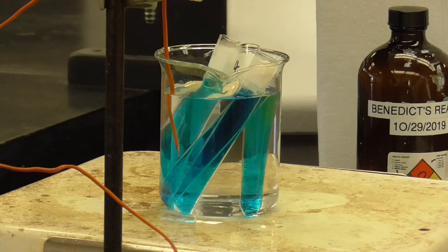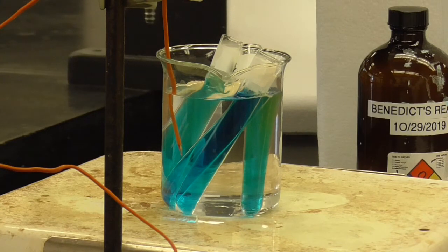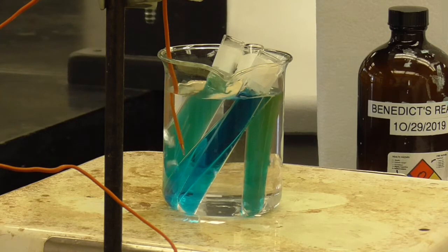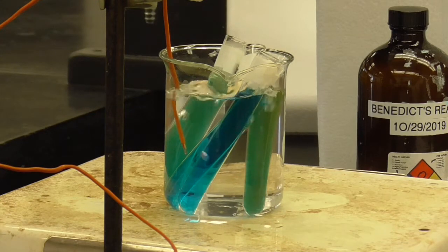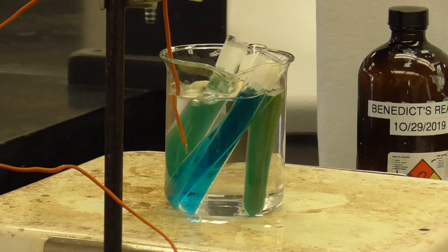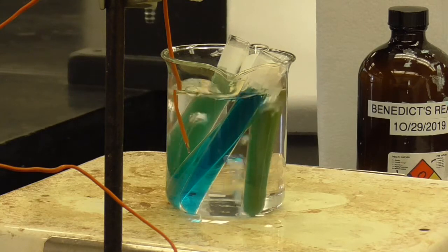Starch is not a reducing sugar. It's too big and complex. It just doesn't have those available. Whereas if you break up starch into glucose, which is the same thing in your blood, by the way, blood sugar is glucose. If you break it up, then the individual glucoses will be reducing sugars. And so this should hopefully correspond with our plate as far as is the starch being broken up. And the Benedict's reagent should show us that.